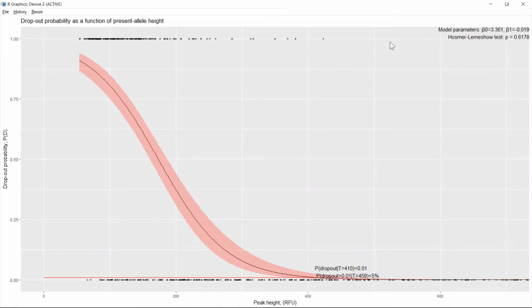And when you have collected all this in a table, you can take an informed decision on what stochastic thresholds to use. A table of different point estimates and conservative values give you a range of statistically supported stochastic thresholds, and you can select a convenient value within this range.